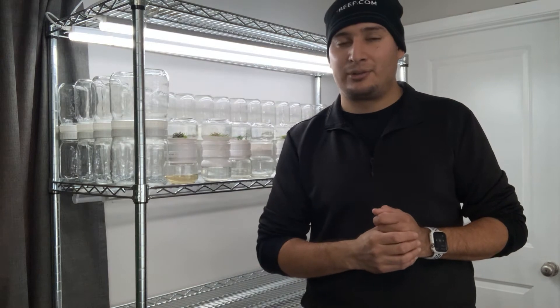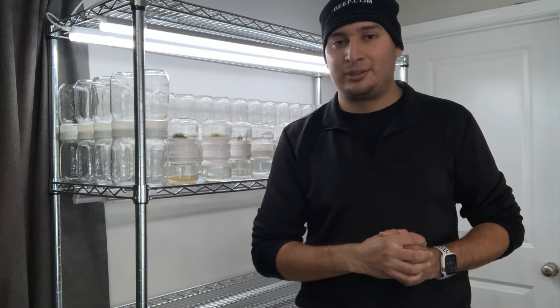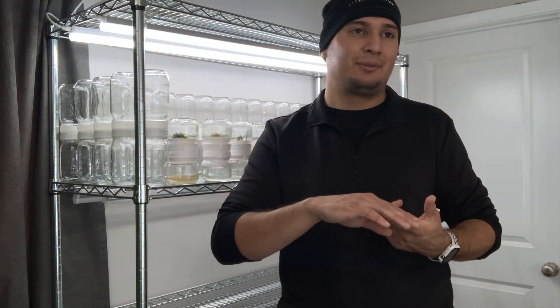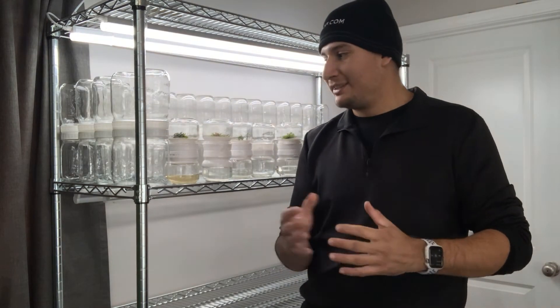I want to show you the full process: sterilizing the plant, getting it established, and all that. You'll need to be patient because it's going to take time — it may not work on the first try. Then I have to get it established in tissue culture, put it into the biocoupler, get it into multiplication media, then potentially rooting media, and then the flask. This process can take several months, potentially well over a year.